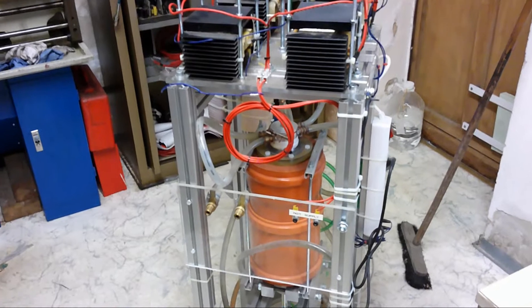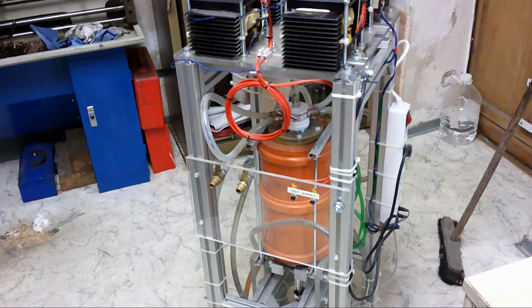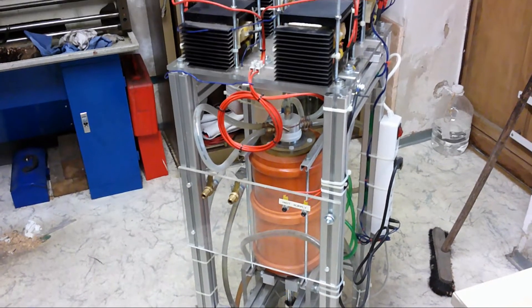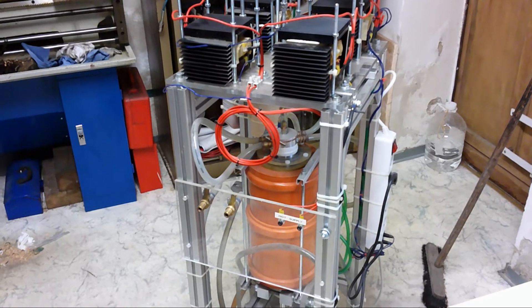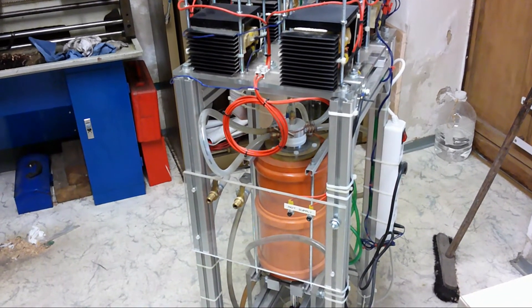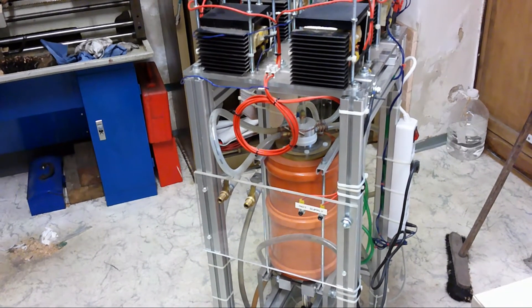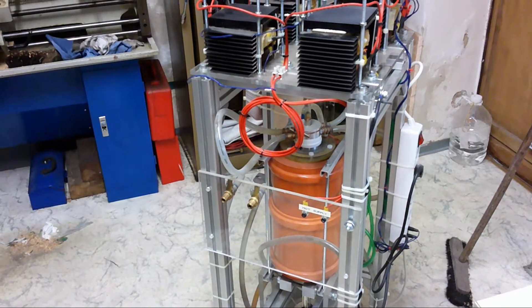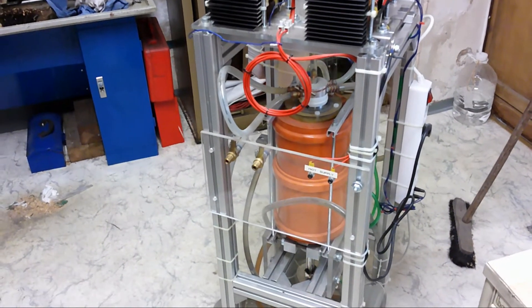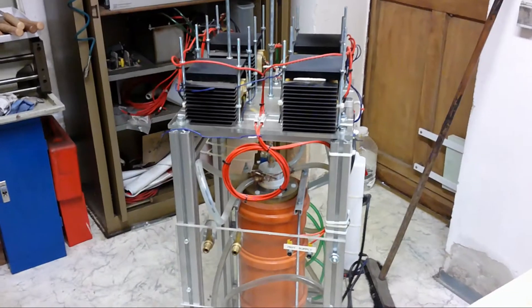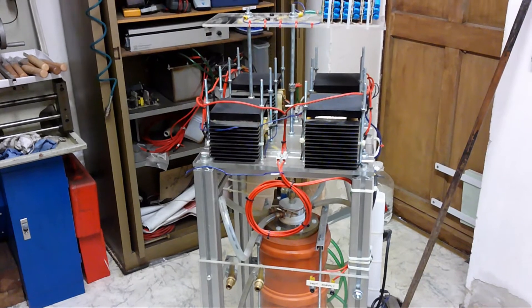So you have nascent nitrogen and nascent oxygen, and they combine to NO gas. NO gas apparently combines to NO2. If the NO2 is bubbled through water, it will react to HNO3, nitric acid, which is a very useful chemical and very needed for metallurgy.